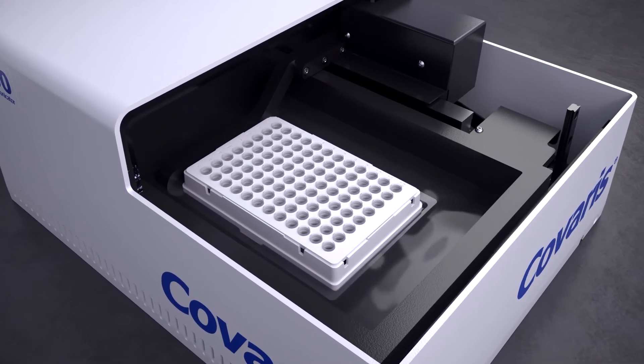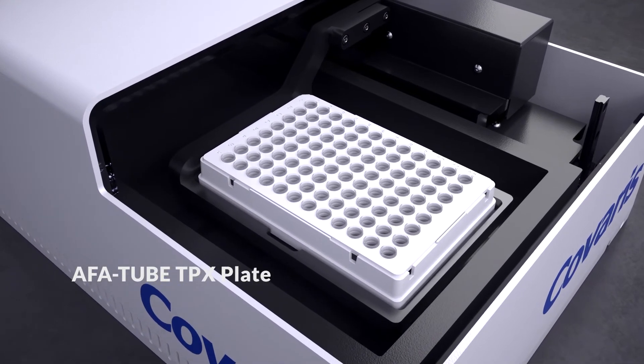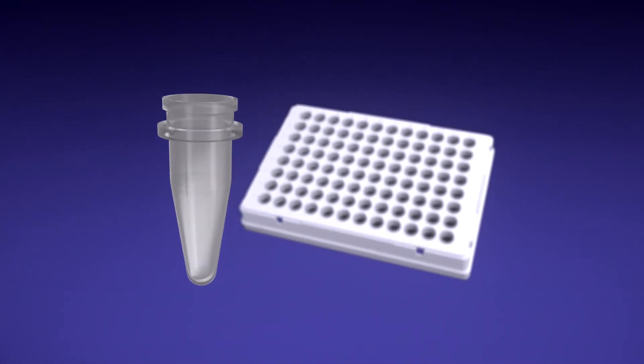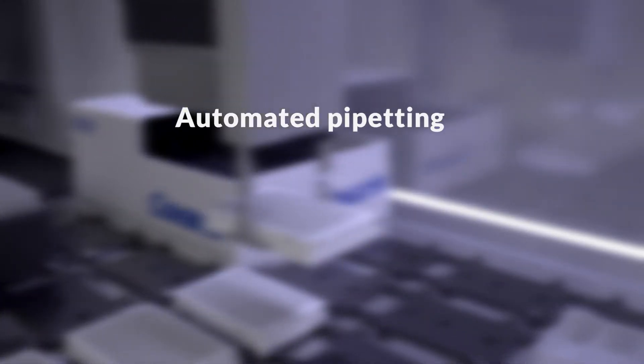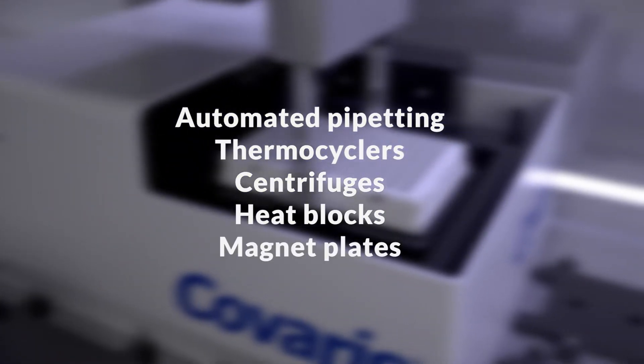This instrument utilizes the fully automatable AFA tube TPX plate, an optimized consumable with a conical bottom, which is compatible from normalization to library preparation, including automated pipetting, thermocyclers, centrifuges, heat blocks, and magnet plates.